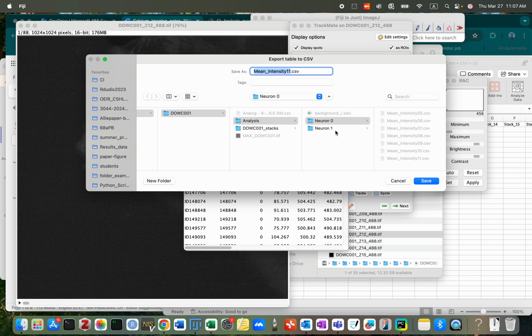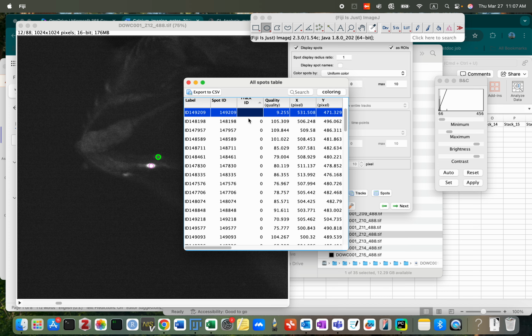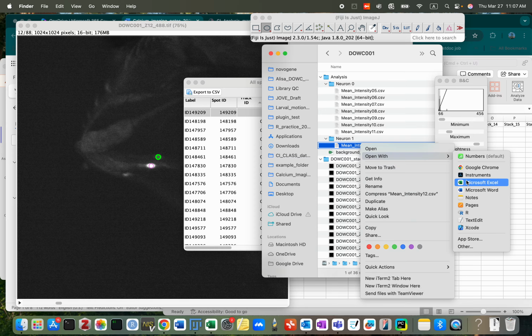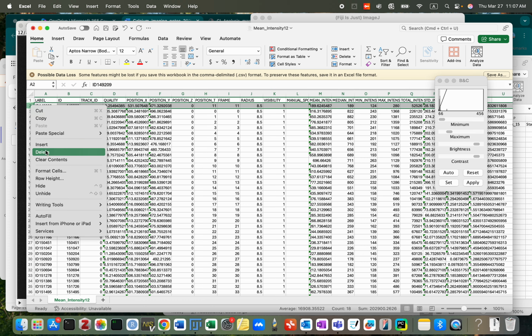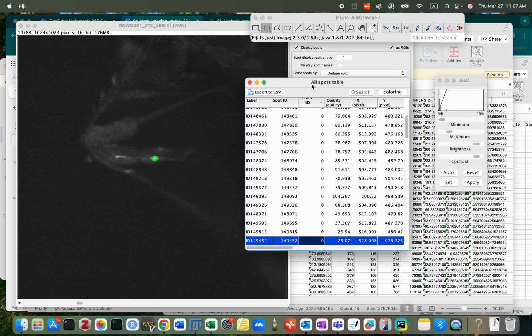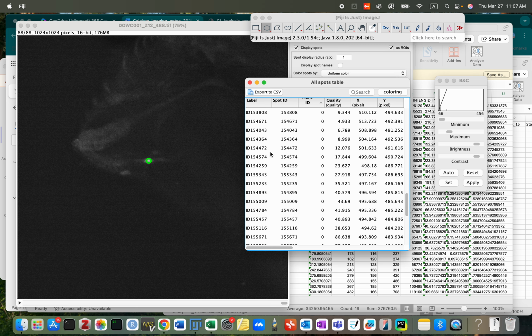Sort by track ID. This is neuron 1, don't forget, okay? Z stack 12. First is wrong, let's delete. And then we check track ID number 0. That's correct. Okay, they are all correct. Cool, easy one.